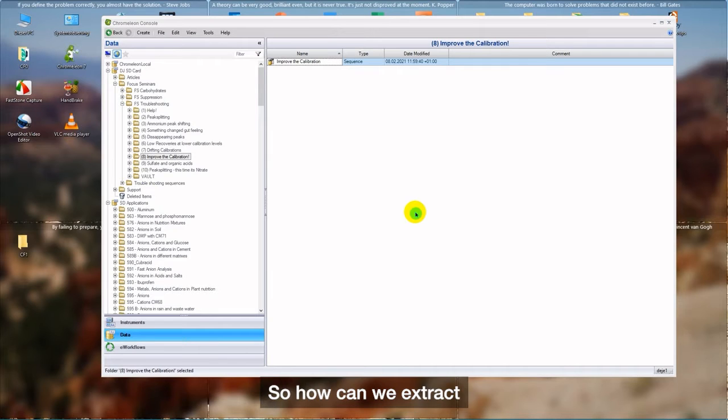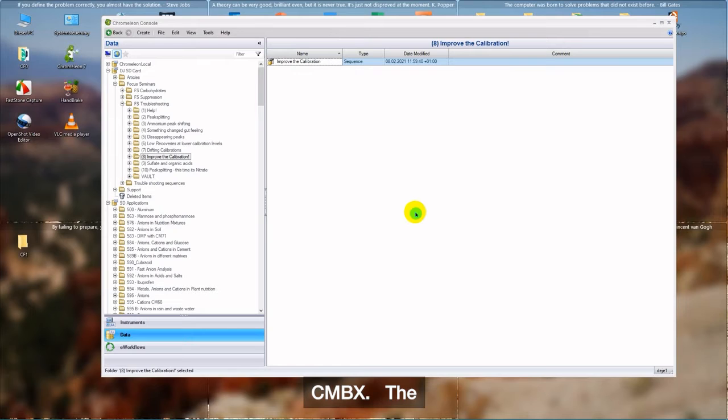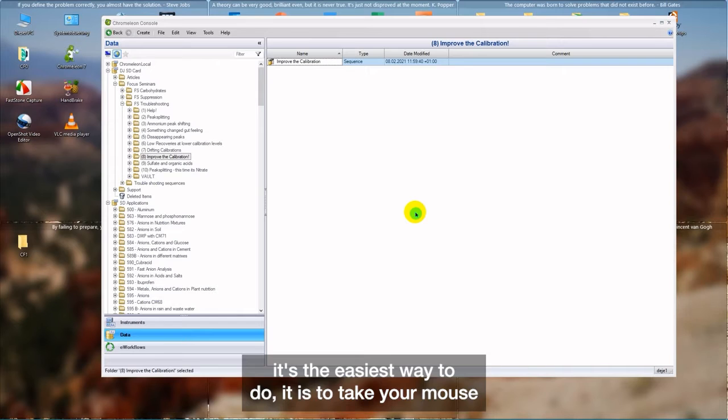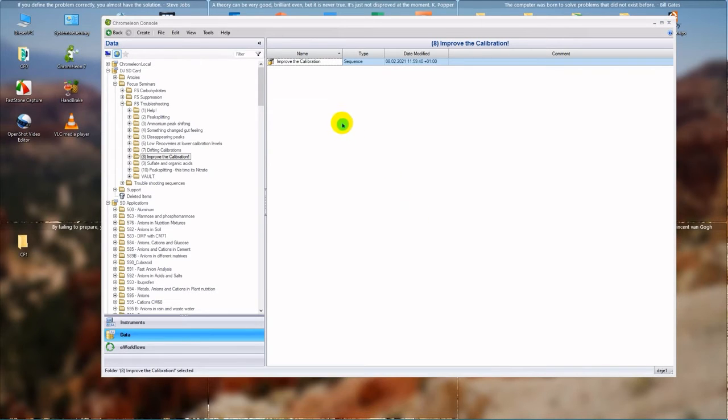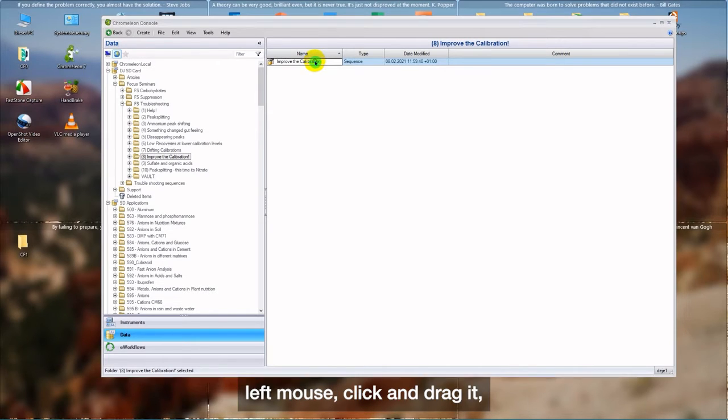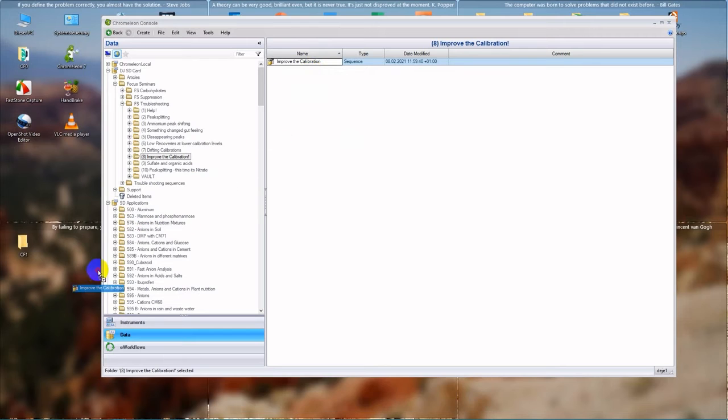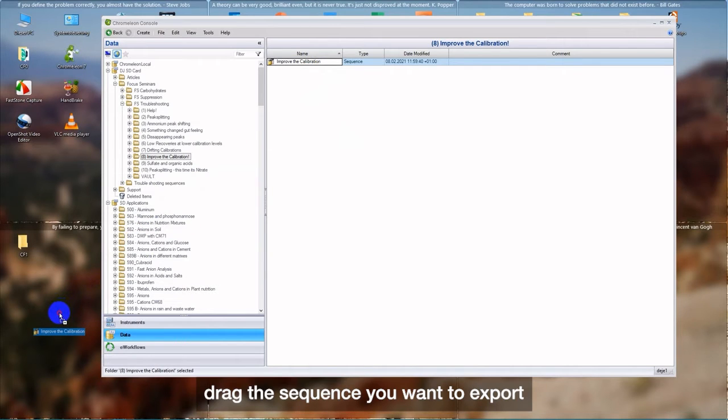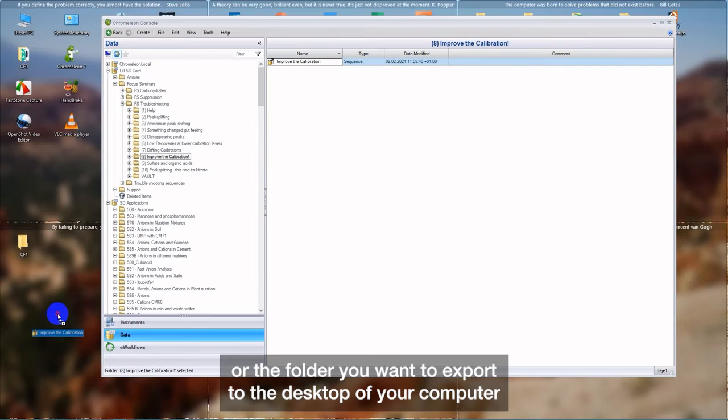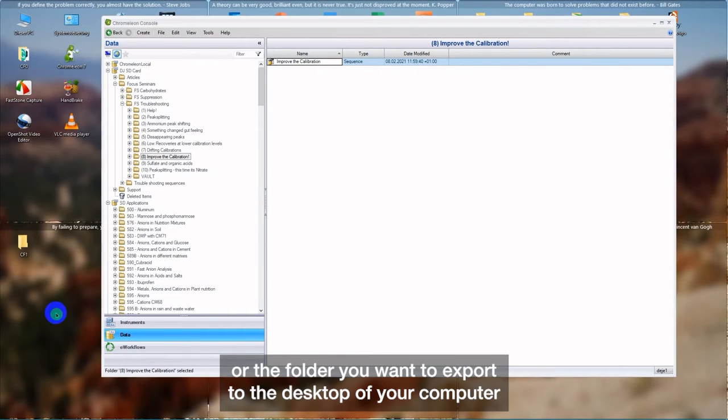So, how can we extract CMBX? The method that I personally like very much because from my point of view, it's the easiest way to do it is to take your mouse to the sequence you want to extract. Left mouse click and drag it. Drag the sequence you want to export or the folder you want to export to the desktop of your computer.